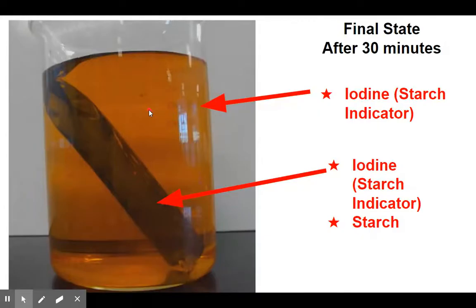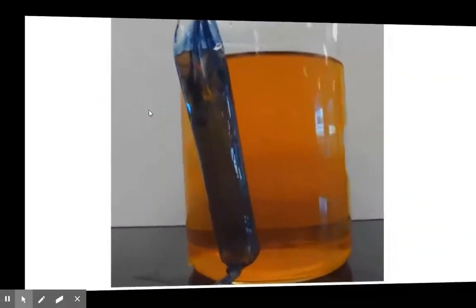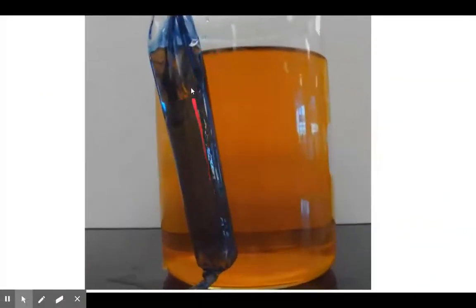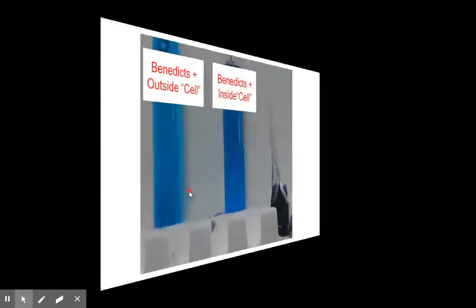What about the glucose? Well, we could actually open up this bag and test for the presence of glucose using Benedict's solution inside the bag. And why not test the outside environment for glucose as well? If you remember, inside the bag there was starch and there was also glucose. So let's see what happened.